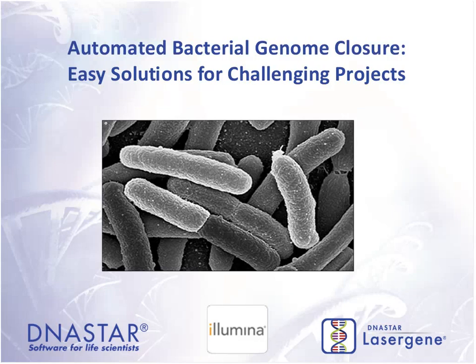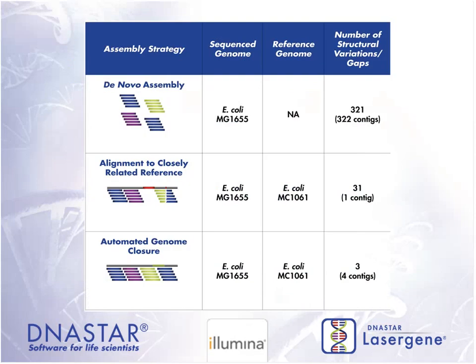And so DNASTAR has many years of expertise, back from when our scientists assembled E. coli, and had worked out some very nice workflows for closing genomes. But they were manual, and it required a lot of expertise to do the closure. And so we thought it would be a great idea to make this a lot easier, both for ourselves and for our customers, to automate some of the more difficult steps.